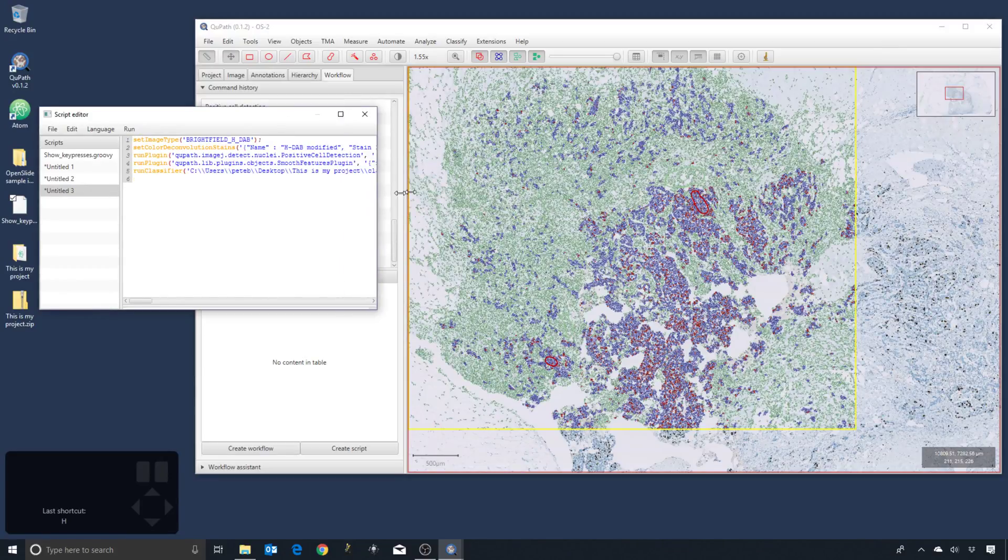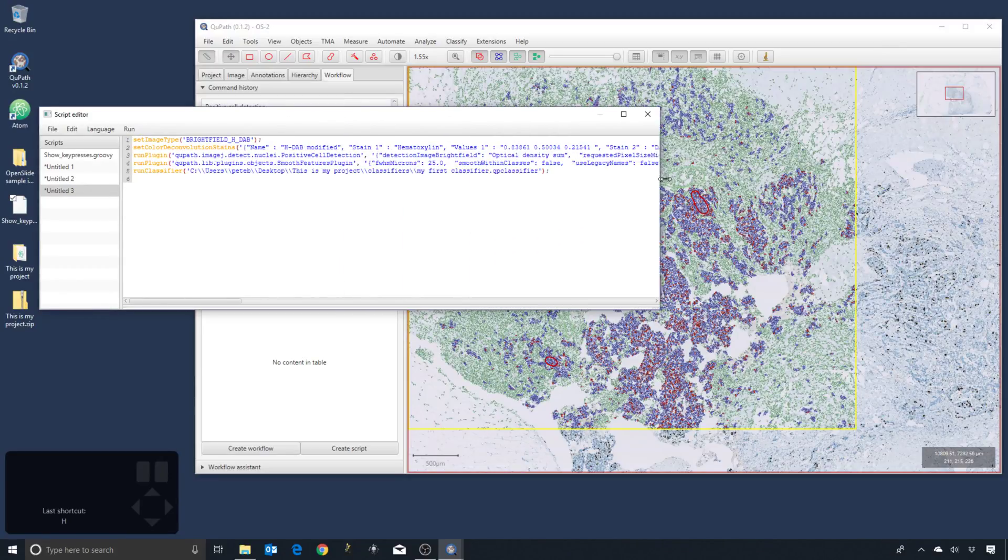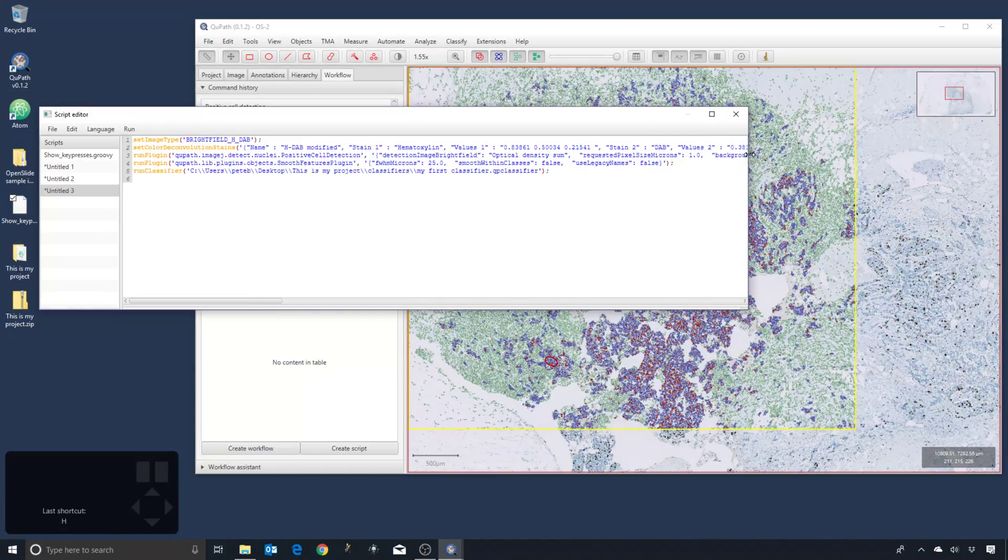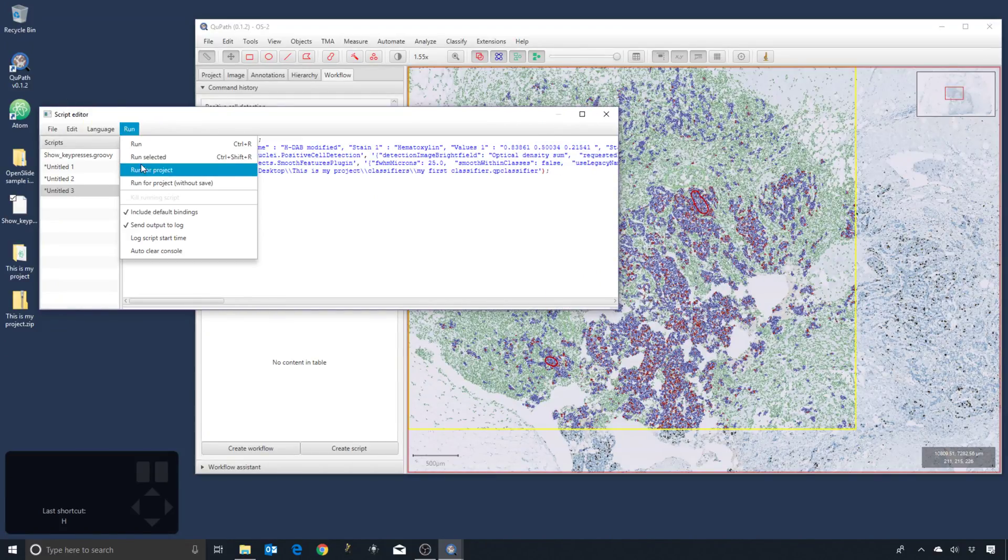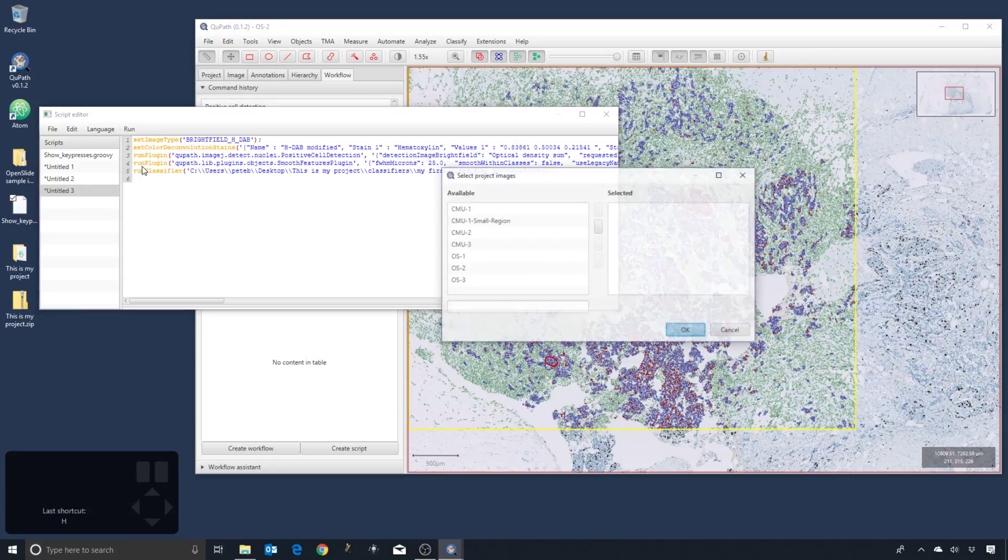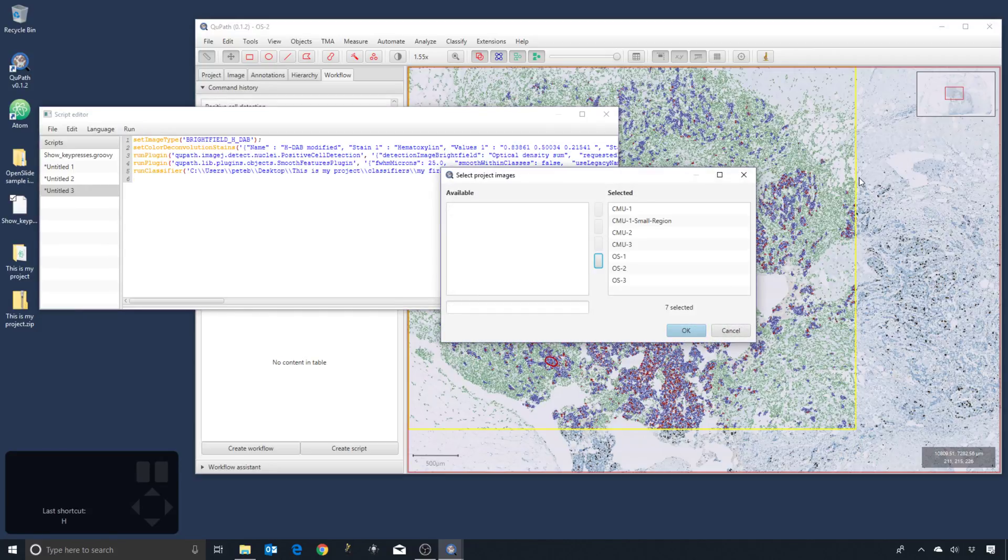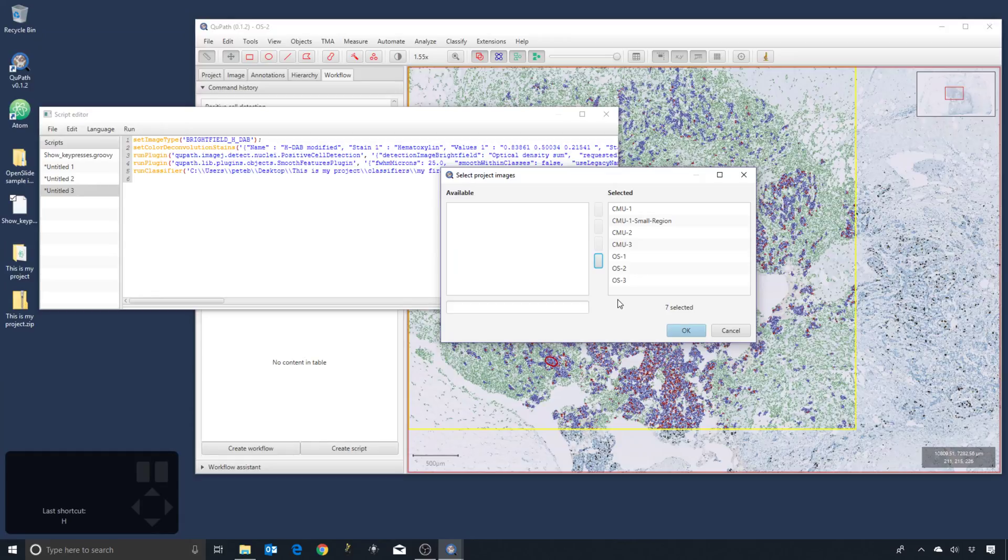Bring your images over and then this will run through all of your images in your project that you've selected and then apply this script.